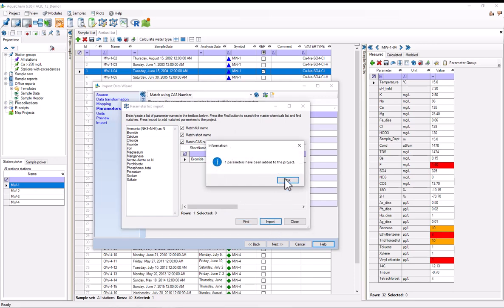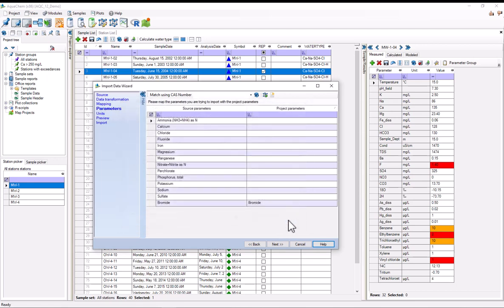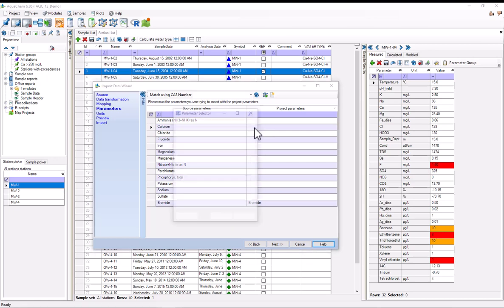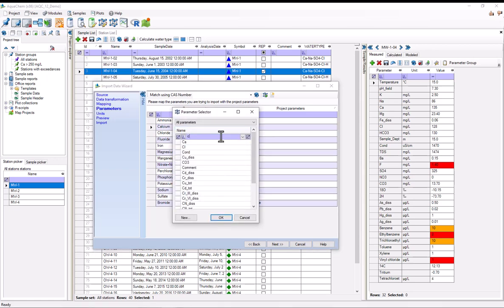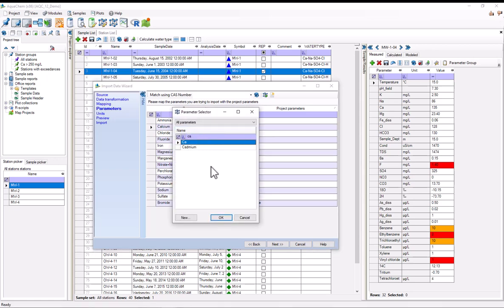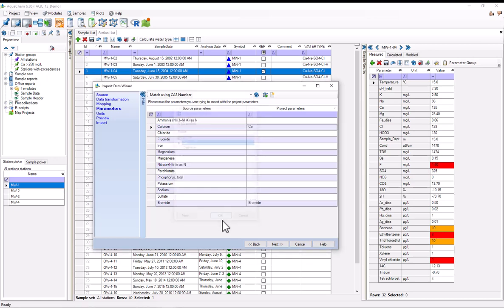I'll hit close, and it's been mapped. For some of these other ones, these already exist as parameters in the database. For example, calcium is already in the project database. If I click on the black next to it, and filter for CA, you can see that we already have it. I'll hit OK. And I'll do that for the remaining parameters that are already in the project database.